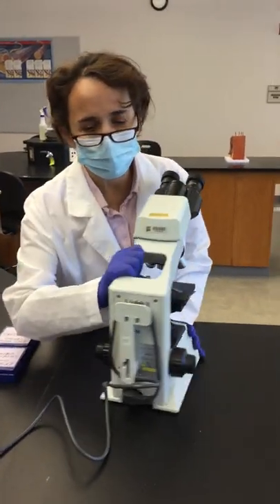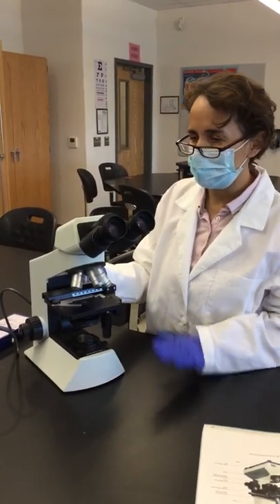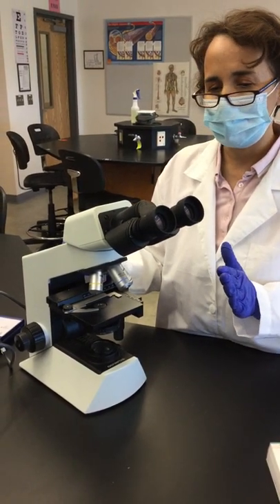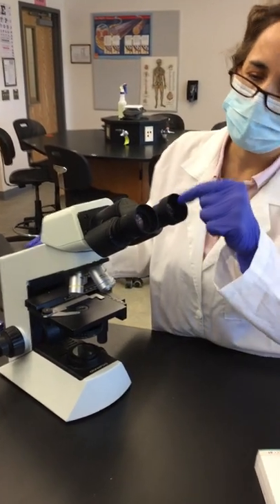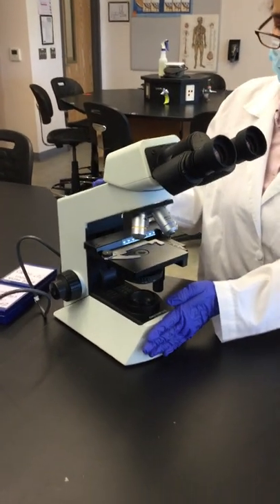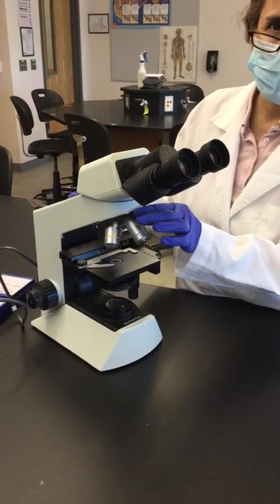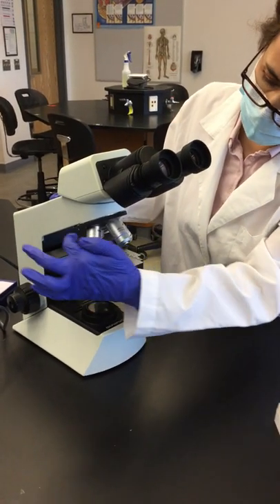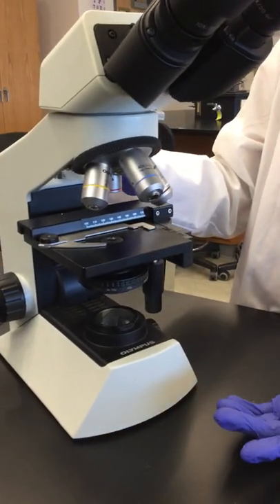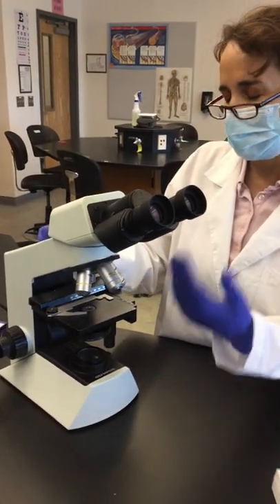Before explaining the focusing procedure, let me identify the parts of the microscope. These are the eyepieces — inspect all pieces before use. The lenses inside are the ocular lenses. This is the arm, this is the base, this is the stage, and these are the stage clips that hold the microscope slide. This is the nosepiece, and all these metal parts are the objective lenses — at the tip of each is the actual lens that magnifies at different magnifications.